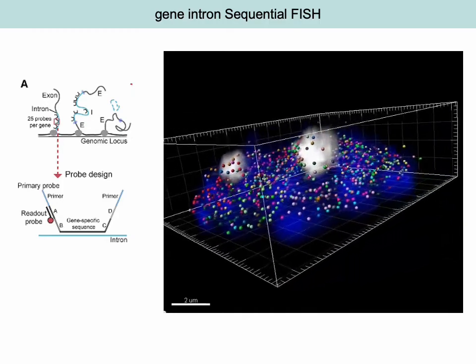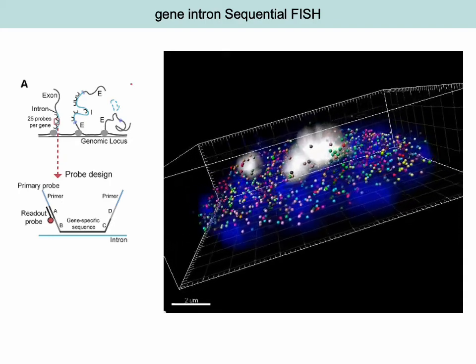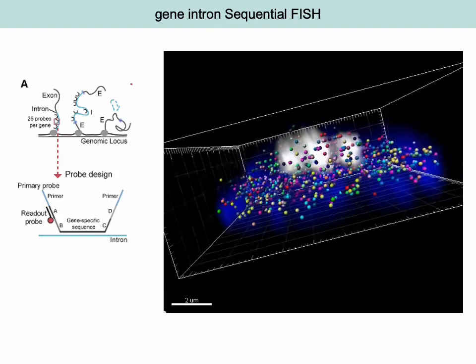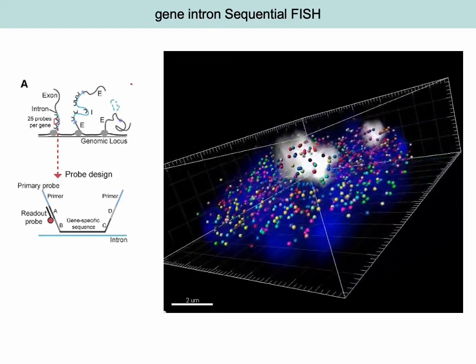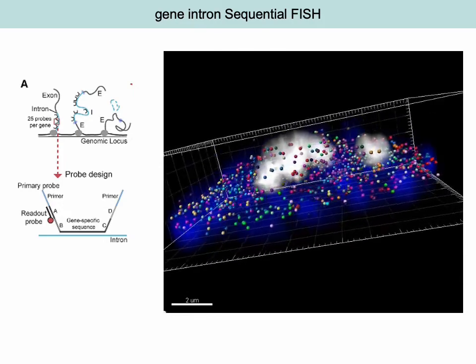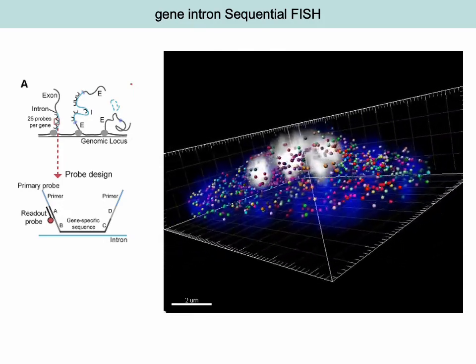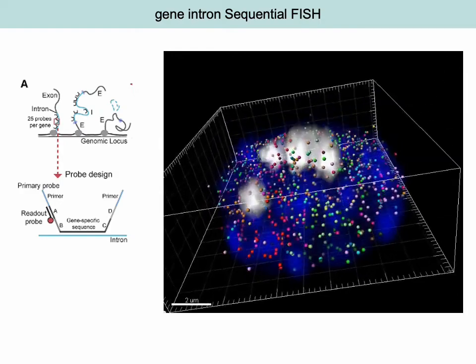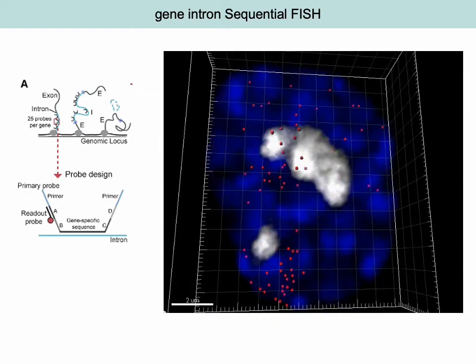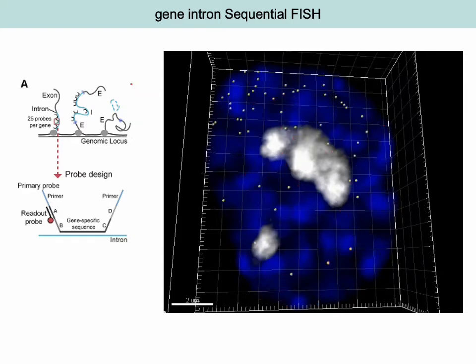On the right side, you can see the nucleus, and each of the dots is a single transcription active site that happens to be transcribing at that moment. Across the different chromosomes, most of the time you can see the two alleles, and you have other nuclear structures like some of the DAPI rich regions in the cells.